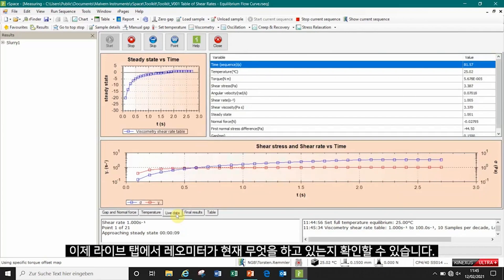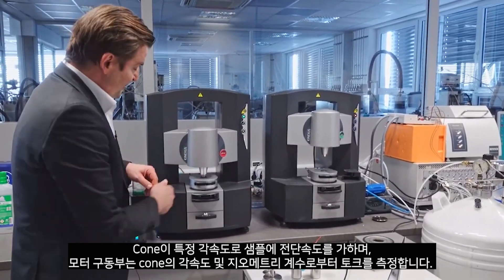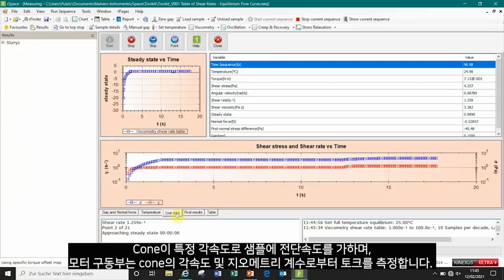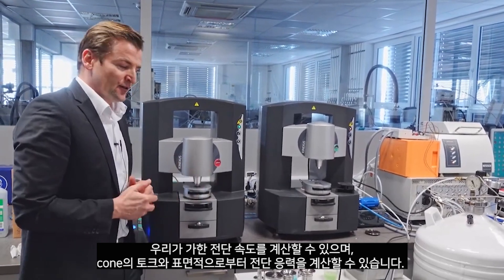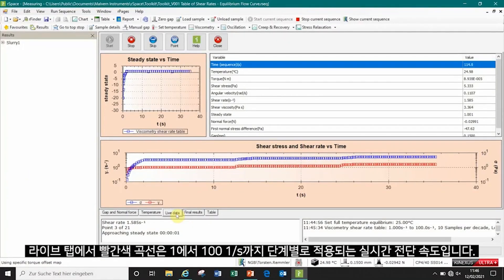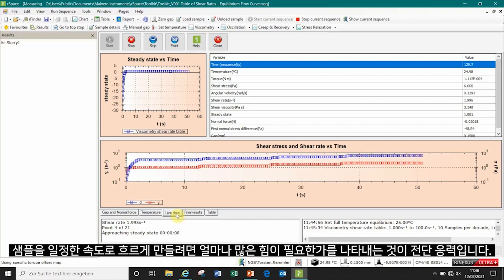From our live tab we can see what the instrument is doing. It applies the shear rate to the sample by applying a certain angular speed to the upper cone, and the motor drive measures the torque. From the angular speed and the geometry factor of the cone we can calculate the shear rate, and from the torque and the surface area of the cone we can calculate the shear stress. In the live tab, the red curve is the live shear rate applied in steps from 1 up to 100 reciprocal seconds, and the blue curve is the shear stress response of the material.